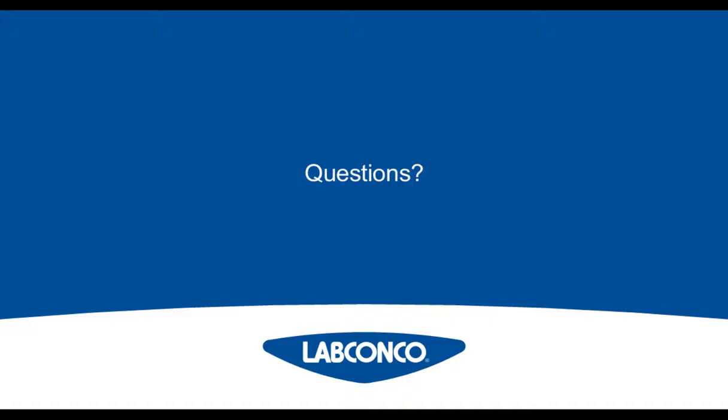Thank you very much. We've had several people ask our next question. So how do you recommend cleaning a fume hood? Yeah, it's a little bit challenging. Because the applications are working with hazardous chemicals, essentially you start at the front and then work your way back. So with the wand I was talking about, you can put on PPE, use soapy water and clean the back of the sash. After that's cleaned, you can then wipe down with general water to clean off the sash so you don't have the residual soaps.